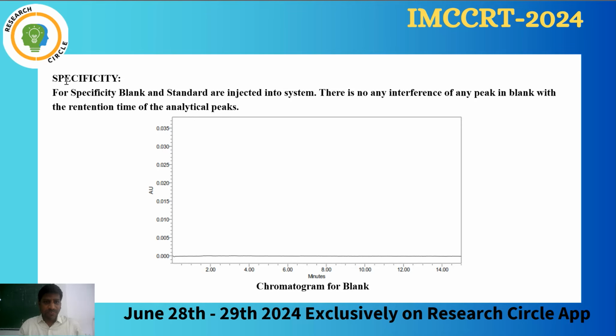Next, specificity. So we have to inject the blank. Blank means nothing, but we inject only the mobile phase.